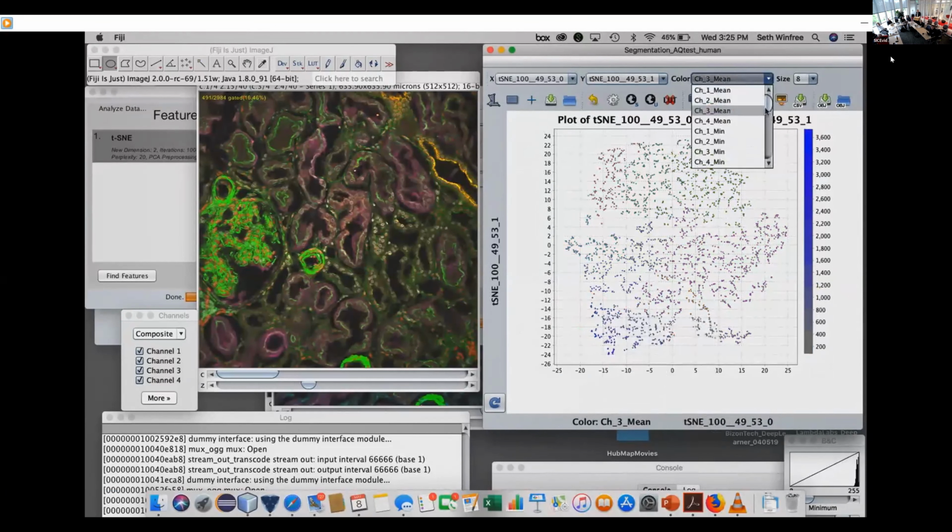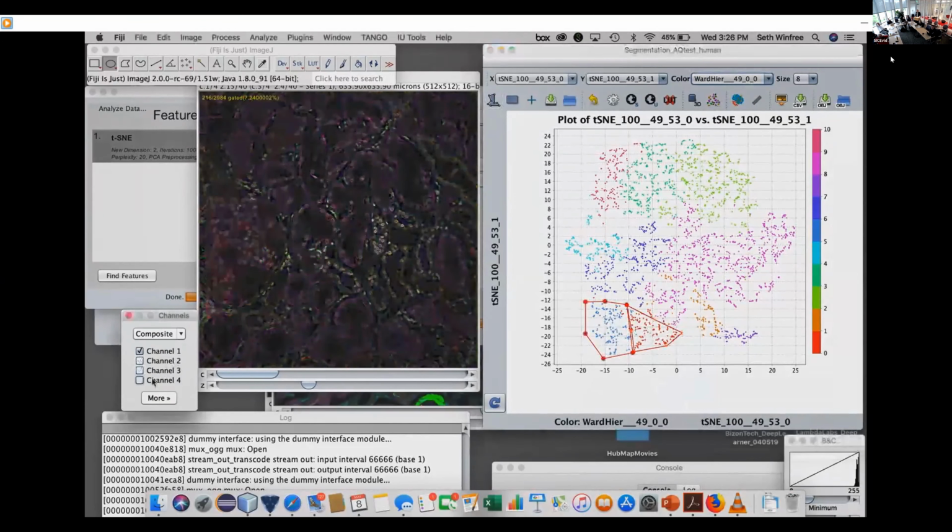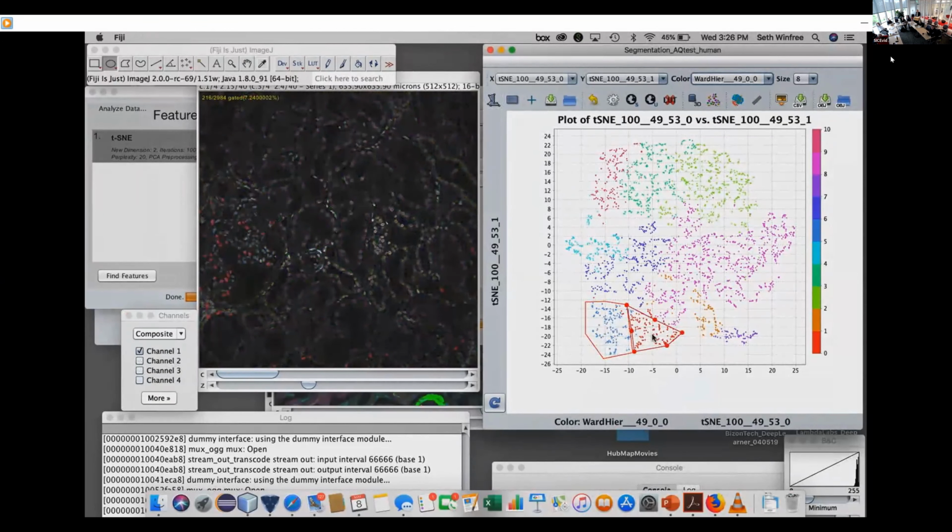And then lastly, I'll apply the hierarchical clustering that I've already done to show that that population, although by intensity looks like it's one population, by clustering it clearly pulls out as two populations, and then actually mapping that. And then in addition to that, mapping it back to the original volume as two different overlays, just to get a feel for what the different populations look like. Basically, a subset of cells that are in the glom, two different subsets in the glomerulus.